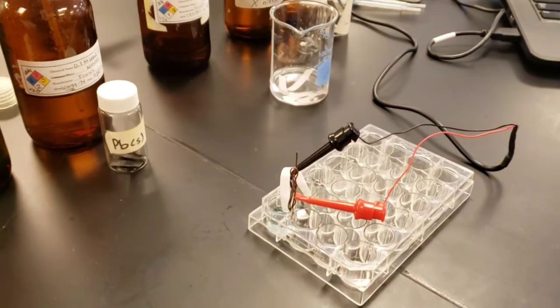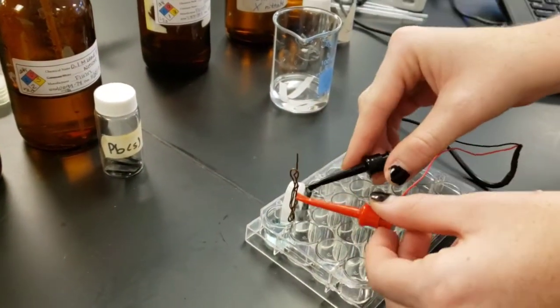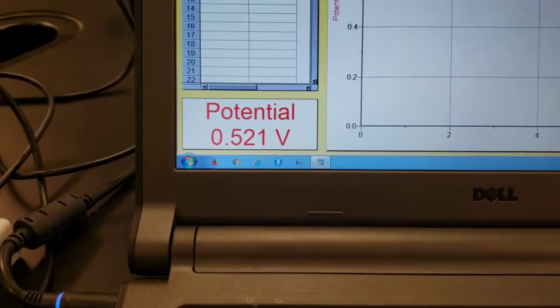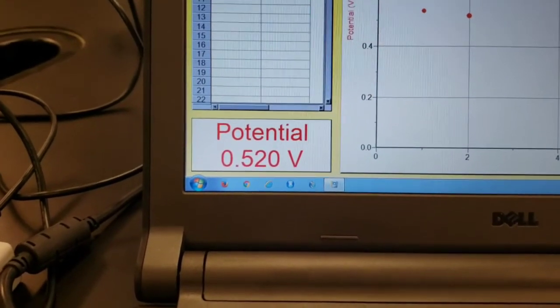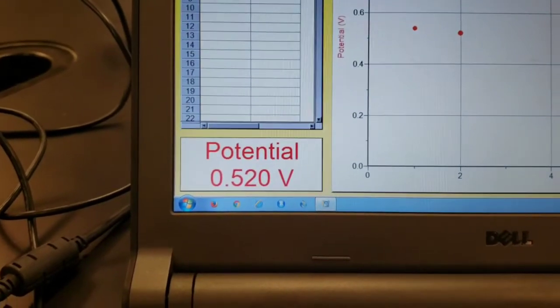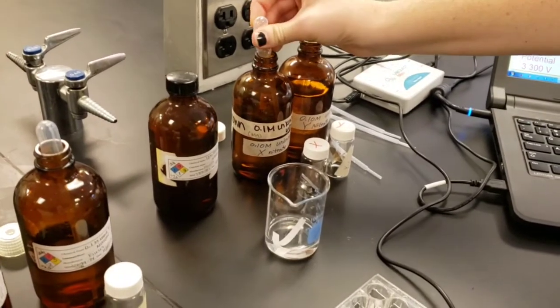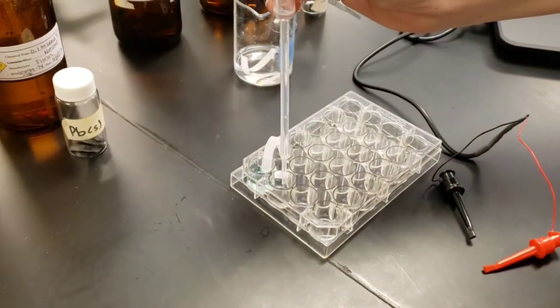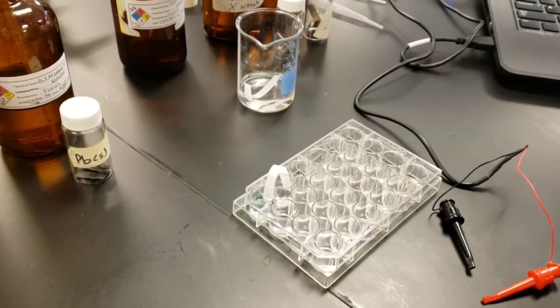Pull the electrodes out of their cells, give them a rinse, put them back, and then reproduce that number at least 3 times. If the cell potential displayed on the computer is a negative value, switch the electrodes, red for black. Next, take solutions X and solution Y and put them into adjacent wells in that well plate.